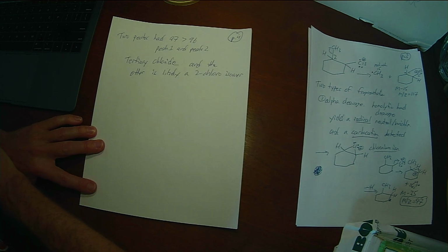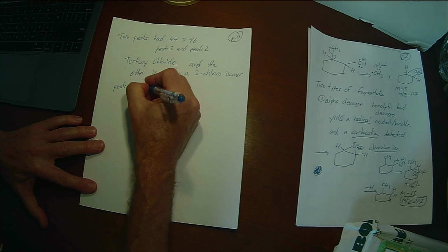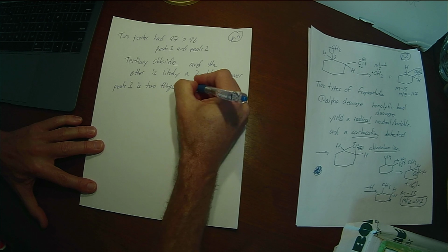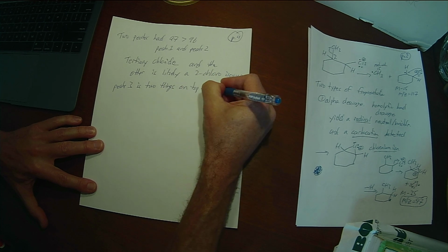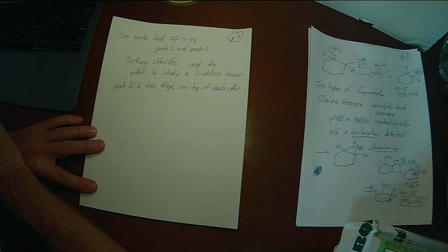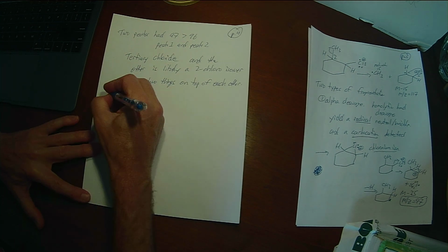The third peak that you see in the GC mass spec, peak 3, is 2 things on top of each other. That's why it's a little bit bigger than the others. My guess is it's the other 2-chloro isomer, and then probably either one of the 3 or one of the 4-chloro isomers, but it's a little hard to tell.